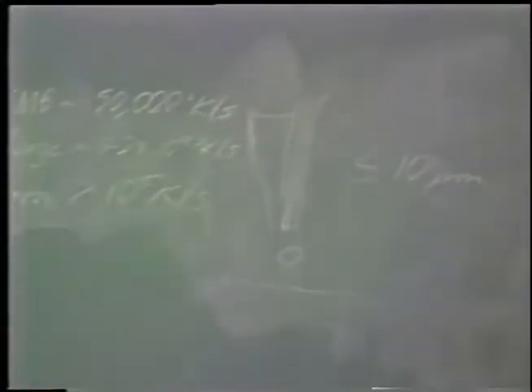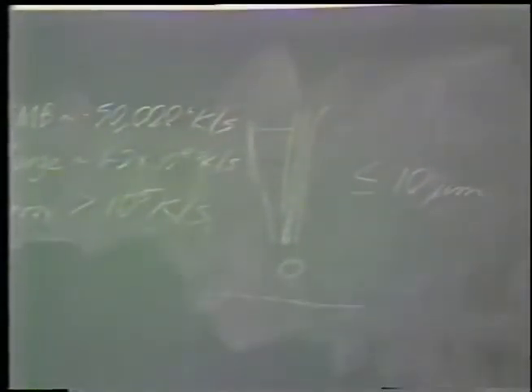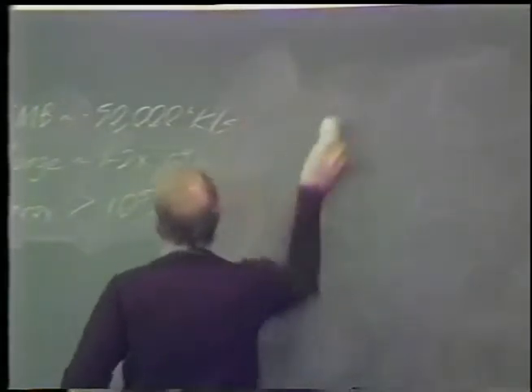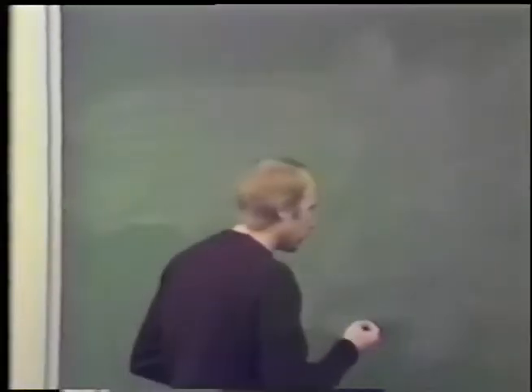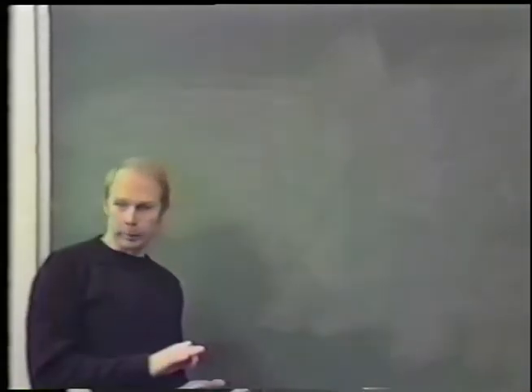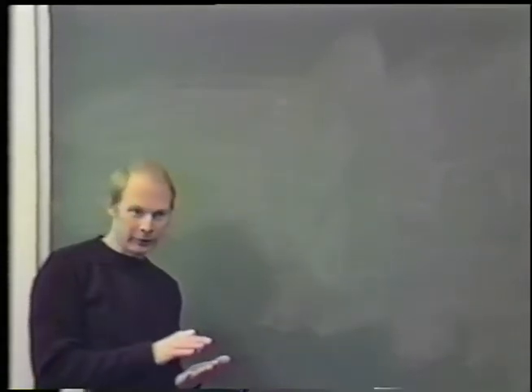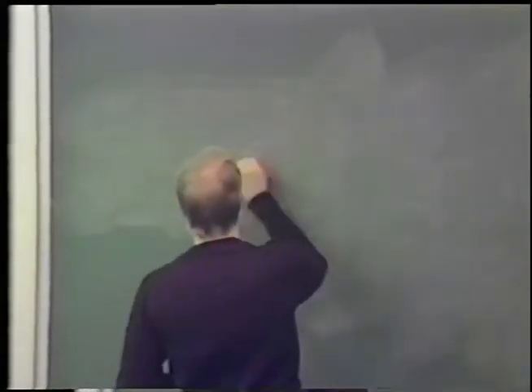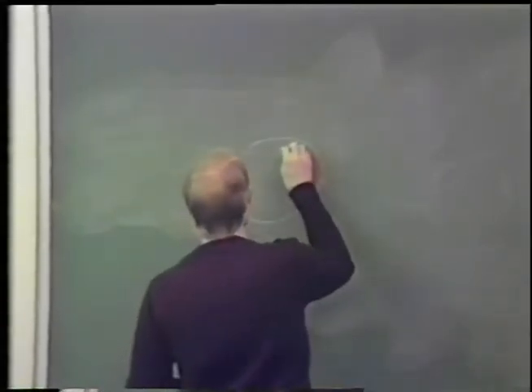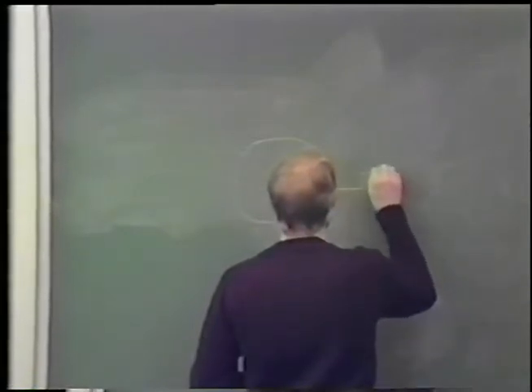Now, that's spraying the sample into the cryogen. Propane jet freezing, we spray the cryogen onto the sample. Now again, the best type of sample preparation that I found is a sandwich preparation, the sample between two thin metal carriers. You have metal carriers which are shaped like Panama hats. They look like this from the top, and in cross-section they look like this.